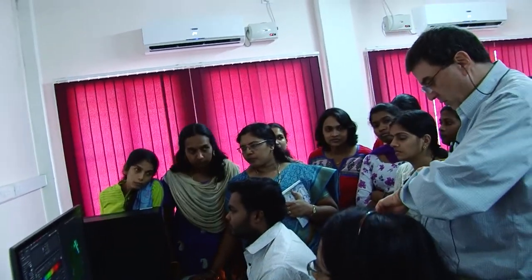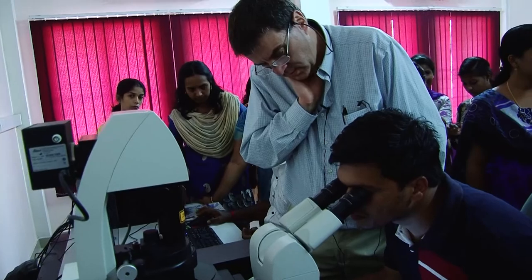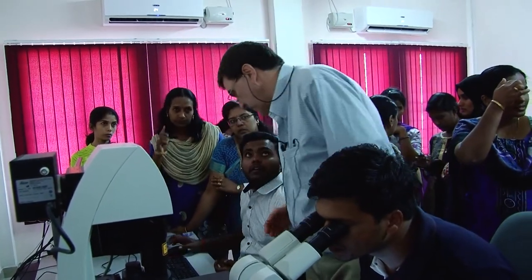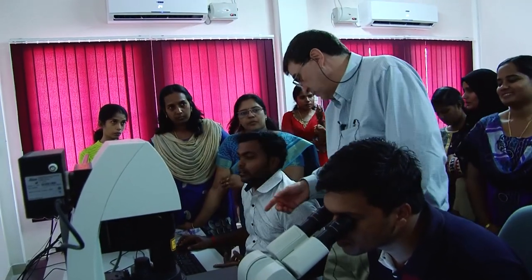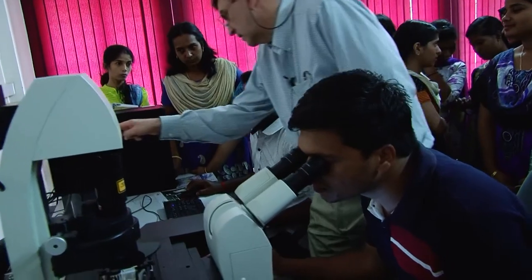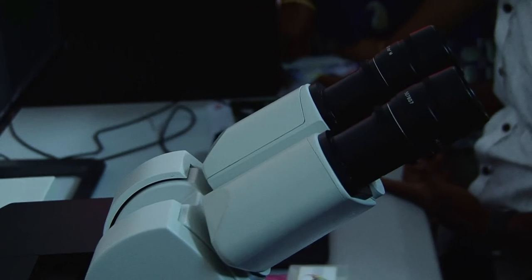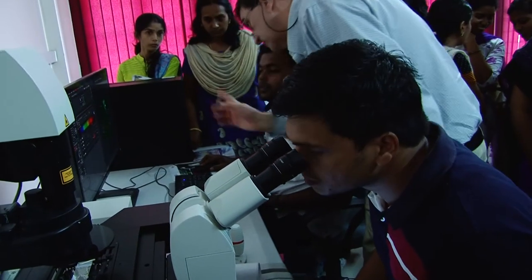Okay, we probably got time for one more out of this group. Somebody else want to sit down and try to do one? So this one we're going to try. This one we're just going to need the red laser probably. We're not going to need green. Because what I'm doing is I'm looking at an H and E slide of an eye. Red only? Yeah, I think red only. But the 561 red. The detector you need red only. This one? Yeah, just that. That's all we need.